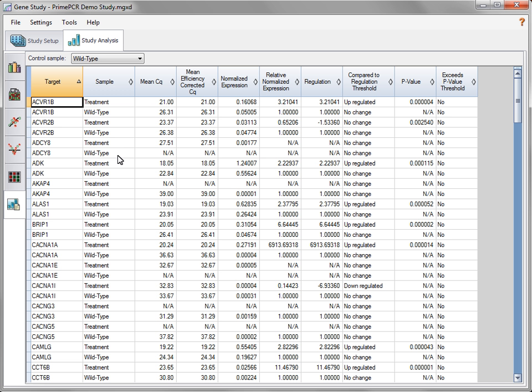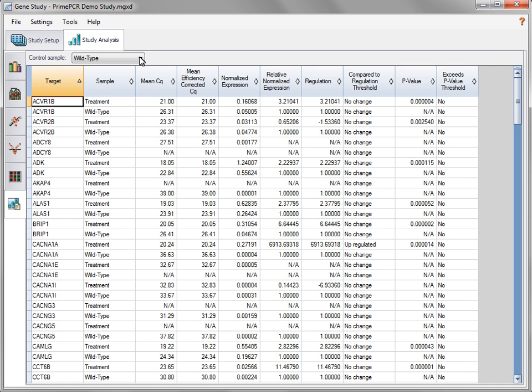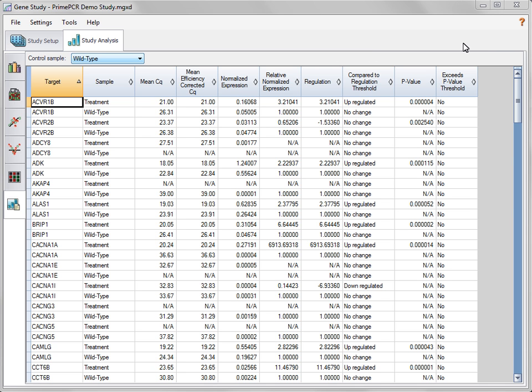The Results tab combines gene expression calculations from all the analysis tabs into a single spreadsheet to facilitate comparison of these values and to ease data export. Choose the control sample to be used in calculations by selecting it from the drop-down menu. As a consequence, you will notice that the relative normalized expression and regulation values for this sample are 1, which is to be expected. To view the data analysis formulas used to calculate the values shown in the spreadsheet, click the Help icon.